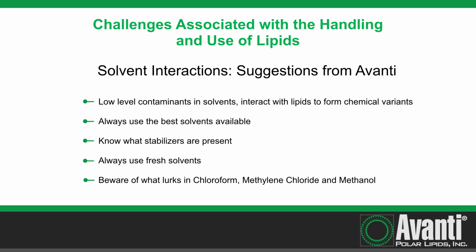Okay, let me talk about some problems that you may have with handling lipids. And these are suggestions that Avanti has come up with, which really should be taken to heart. First of all, solvents contain low levels of contaminants. I don't care which one you buy. There's always going to be some contaminants in there. And some of these contaminants can interact with the lipid class that you're looking at. So one has to be aware of that.